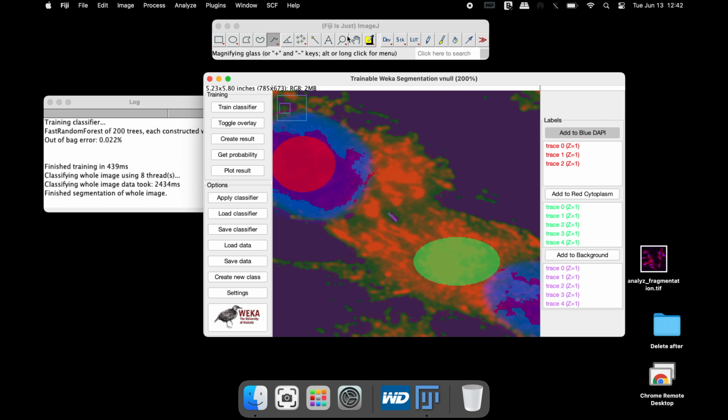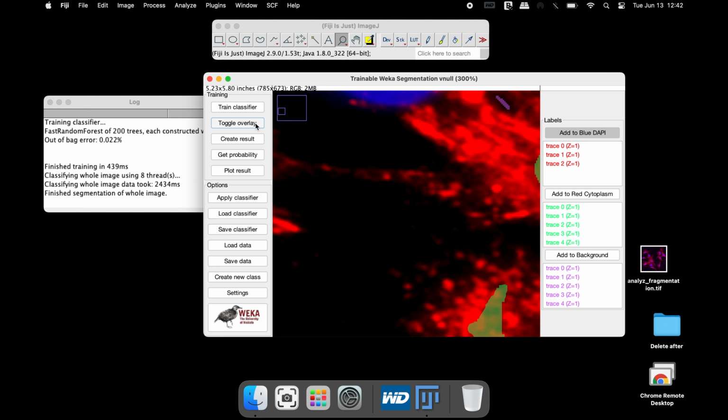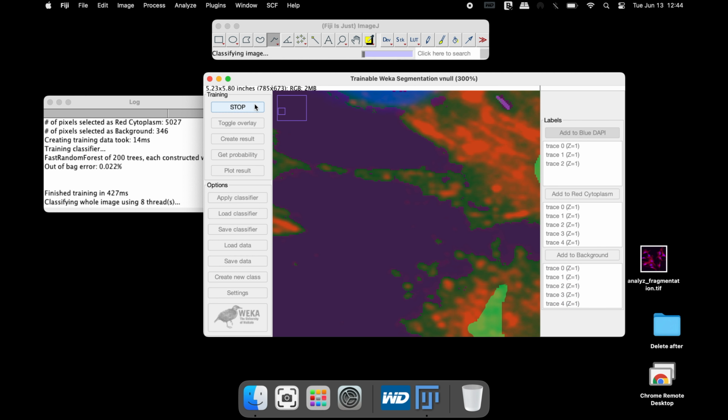At times, many sections of the image may need more training for the segmentation process, to achieve a good and clear separation of the objects. Assigning a specific region to any class can also be reverted if required. Head to the label and double-click on it to remove the assigned region of interest. Again, click on the Train Classifier to apply the modified changes.